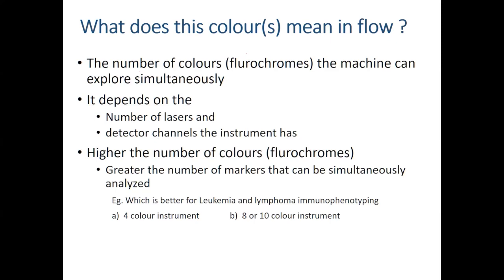Normally people get happy: more colors, the merrier. But everything comes with a price. What is the problem when you go for high color instruments? Yes, Hari. Hari is an expert. Sir, compensation. Yes, compensation. Everything comes for a price.